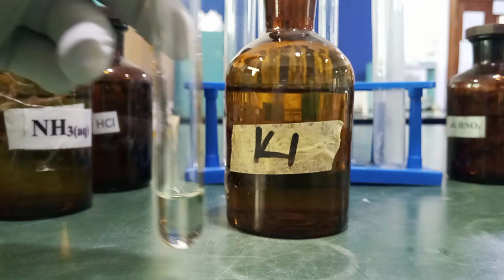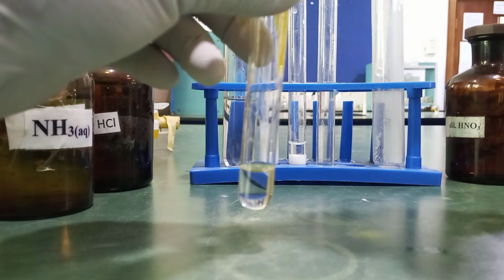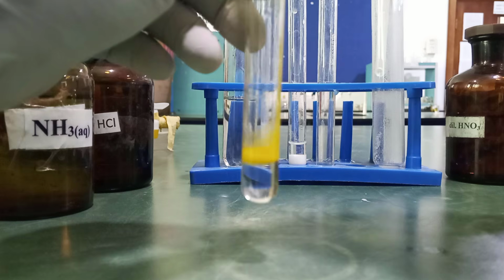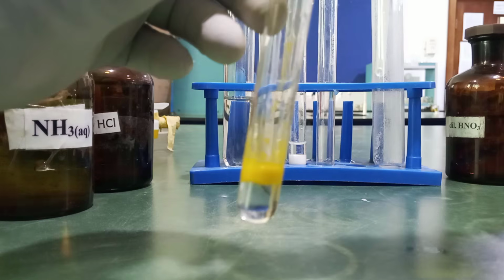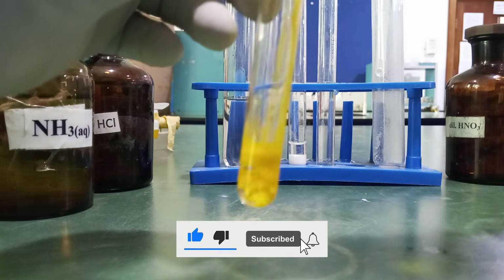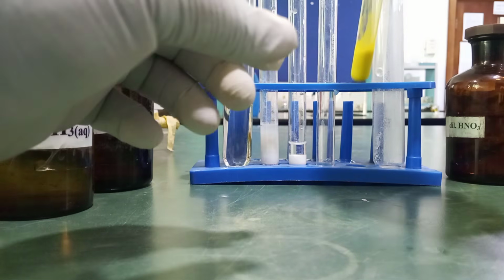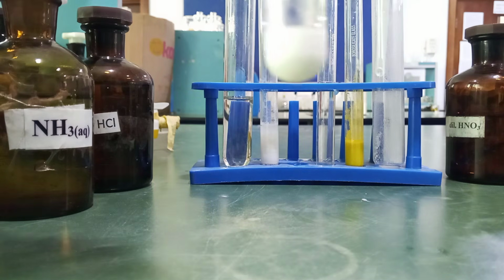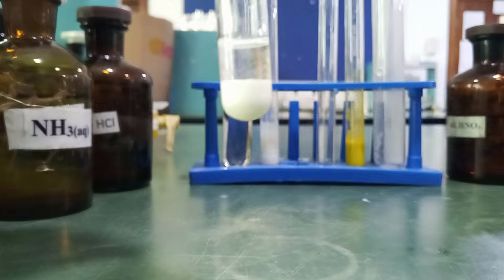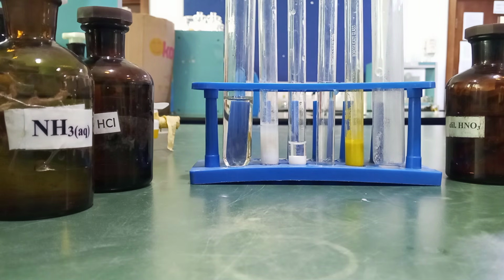Can you see that? Okay. So if I add this, wow, can you see? That's already a yellow precipitate, even without mixing completely. Okay, wow. So I don't even need to carry out the warming of this lead(II) chloride to see whether it will dissolve. It will definitely dissolve, because potassium iodide has confirmed that it is lead(II) ion that is present.